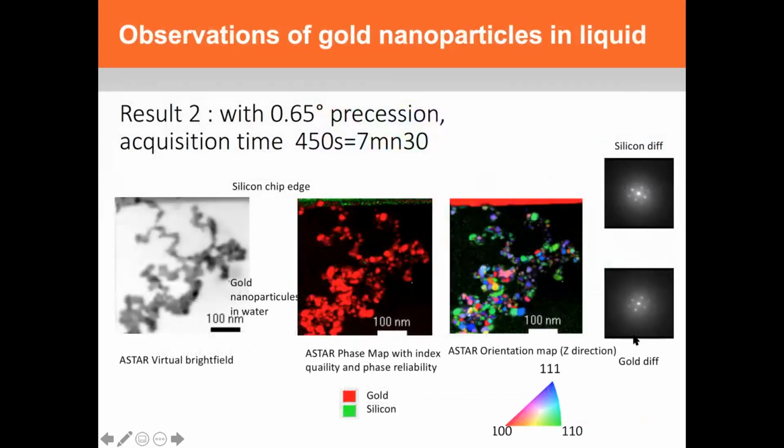And then I thought this might be interesting. This is a Protochips liquid holder. This is some work we did in Europe last year, and we actually were able to map orientation of nanoparticles in a liquid and get very nice results. So it was a surprise to everyone that you could maintain the positioning of these particles in the liquid long enough to do the maps.